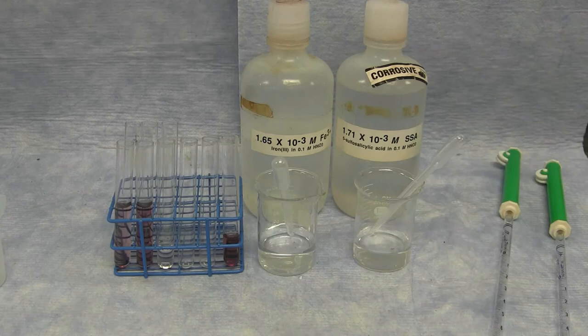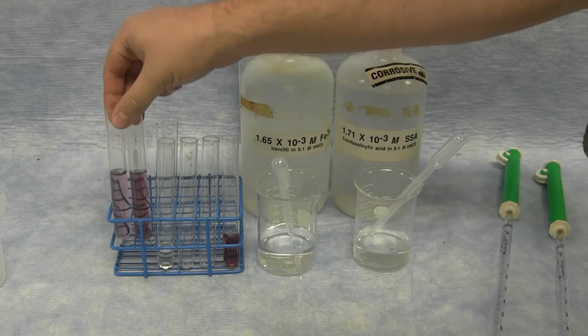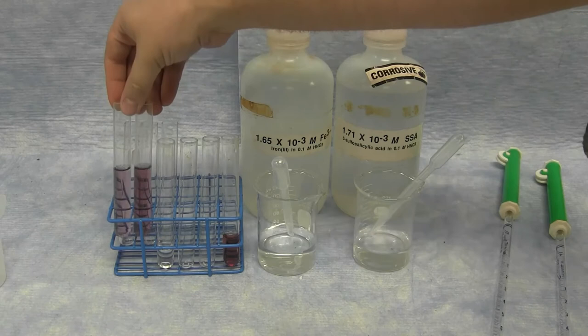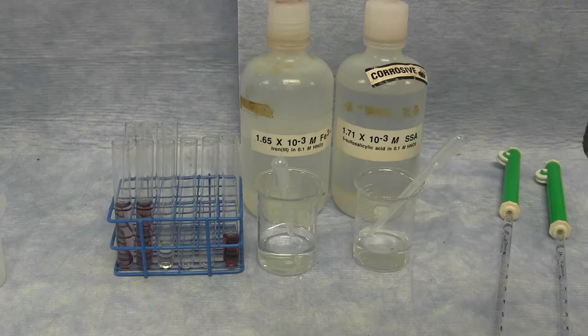As you prepare these solutions, you'll notice the intensity of the color changing and going up and down. You can then measure the intensity of this color using the spectrophotometers in the room. Once you have the absorbance and the intensity readings of all of your solutions recorded, you can prepare a graph of the mole fraction of SSA on the x-axis and the absorbance value of each solution on the y-axis.